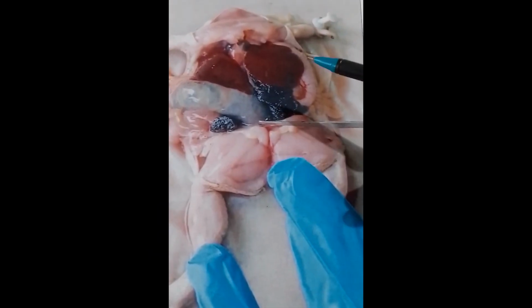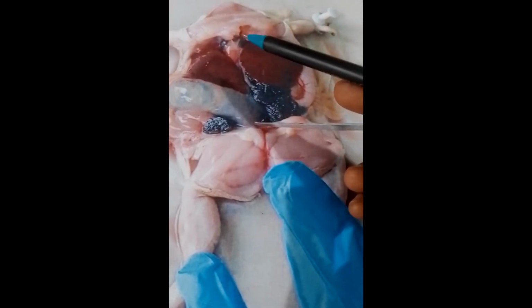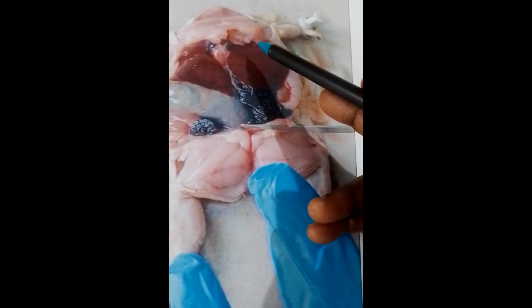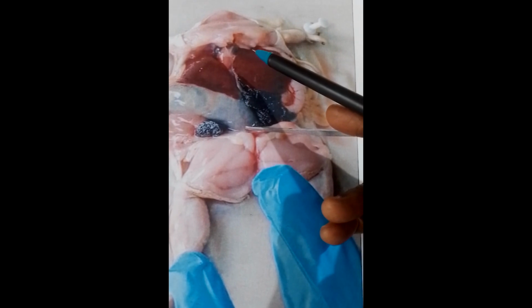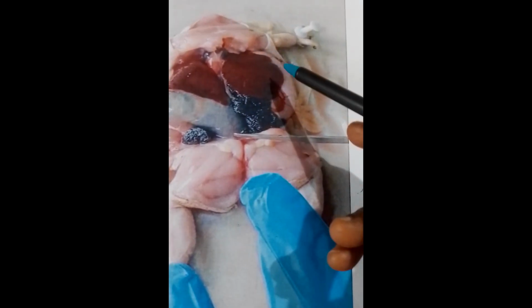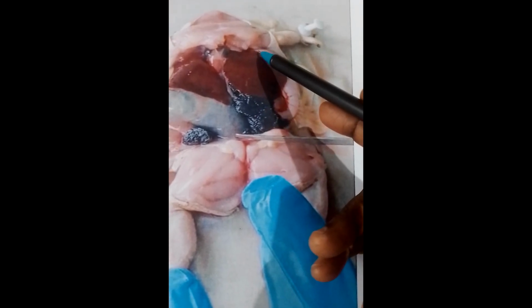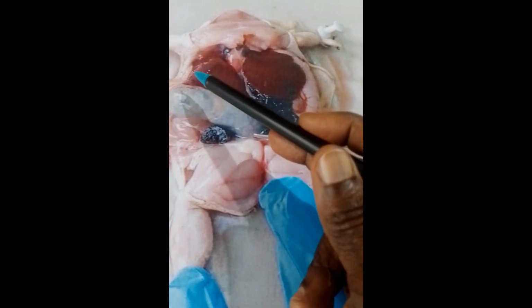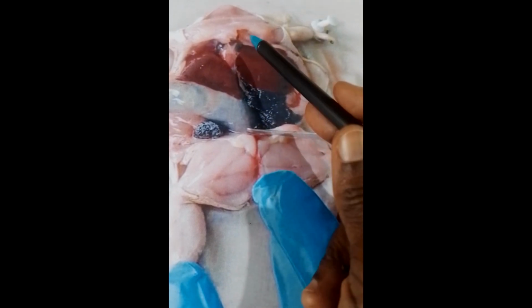Now, if you look at this other dissection, you can see the heart there. You can see a lung there. You can see another lung there, even though part of the liver covers the lung, but the lung is there. There's the stomach, which covers part of the lung, but it's still there. The liver lobe is also covering part of the lung. But you can see that this area that I'm marking out is where the thoracic cavity is.